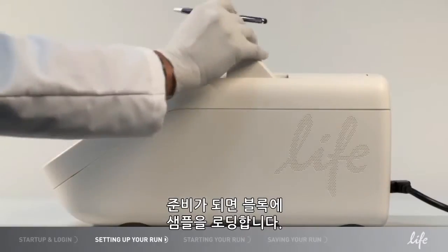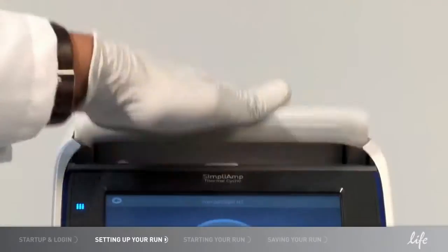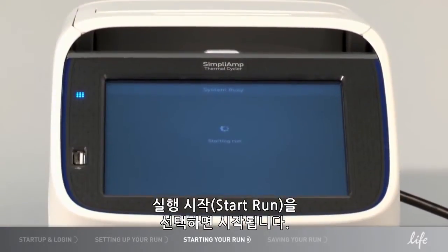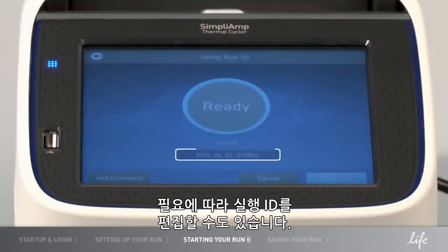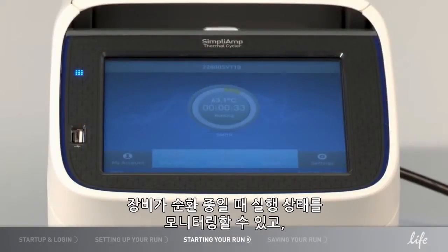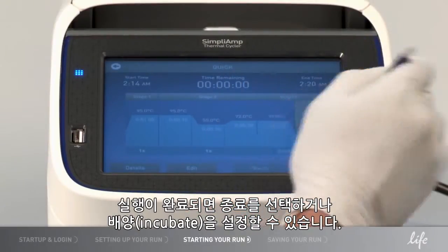Load your samples into the block when ready. Select Start Run and your run will begin. You can also edit your run ID if you wish. You can monitor your run as it is cycling. And when your run is complete, you can choose to end it or set it to Incubate.